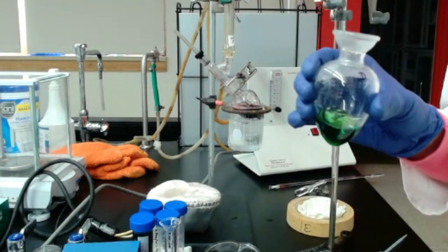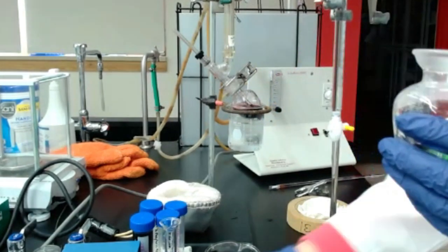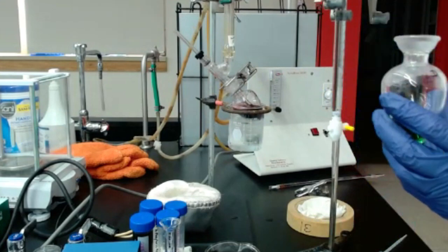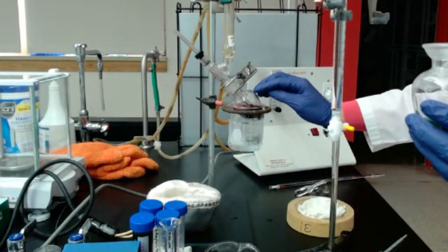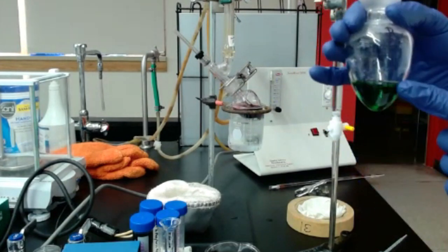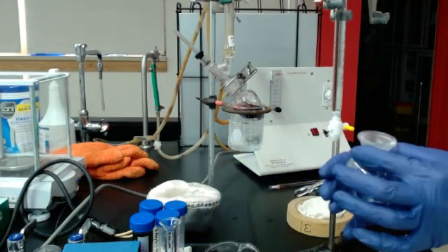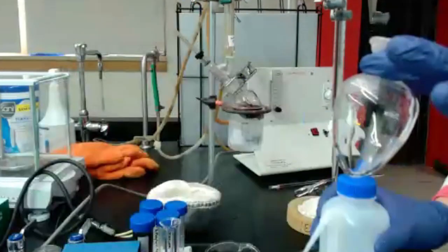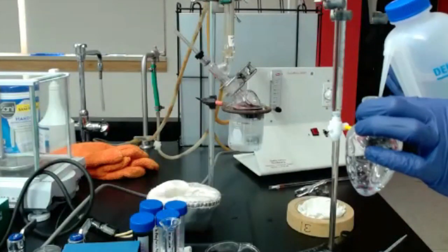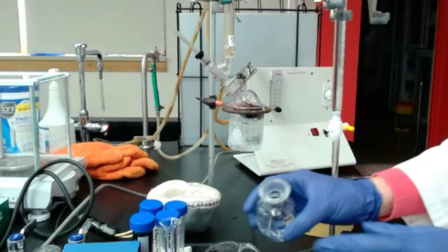I'm just gonna throw that away now because I want to do bound SO2. And so I'm just gonna keep using that acidified wine, but I'm gonna heat it to release the bound SO2. But I need to prepare a new solution of the D flask. So I'm just gonna put that in the trash. I'm gonna clean that flask with some DI water, making sure you don't have any more sodium hydroxide, hydrogen peroxide, all of those.